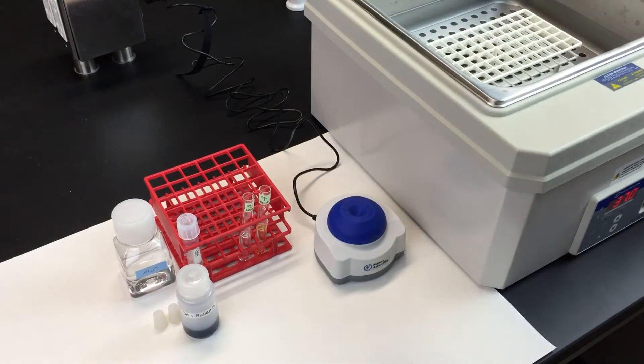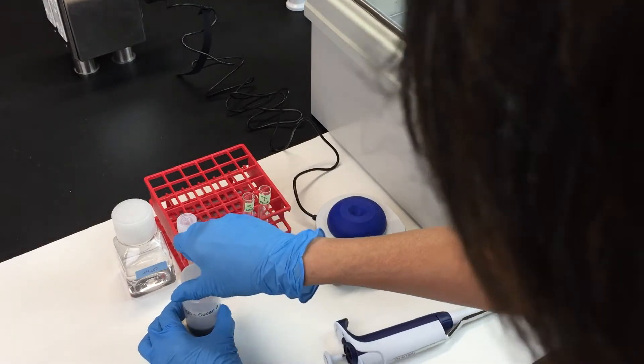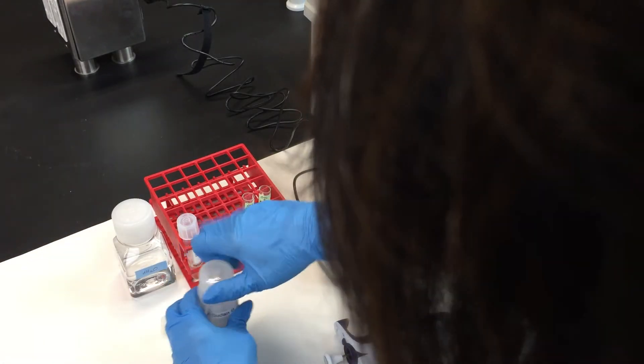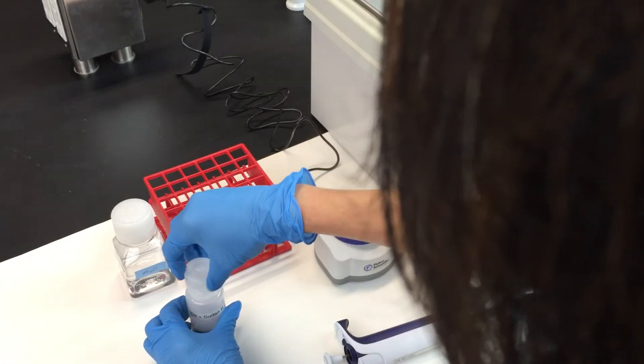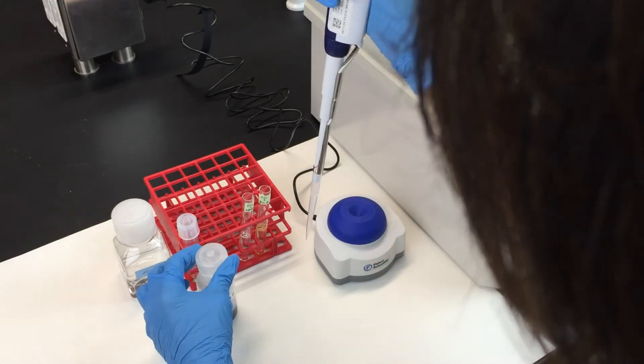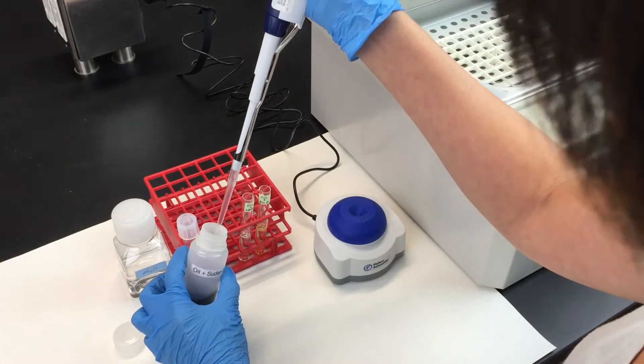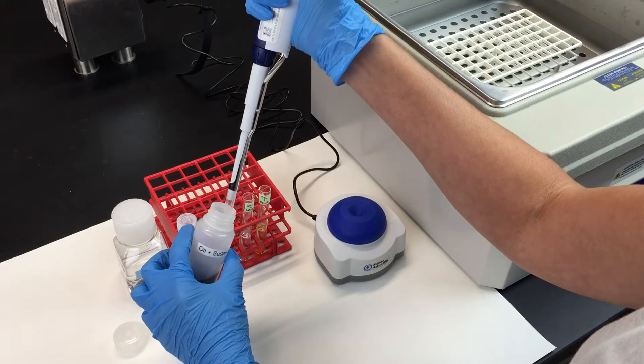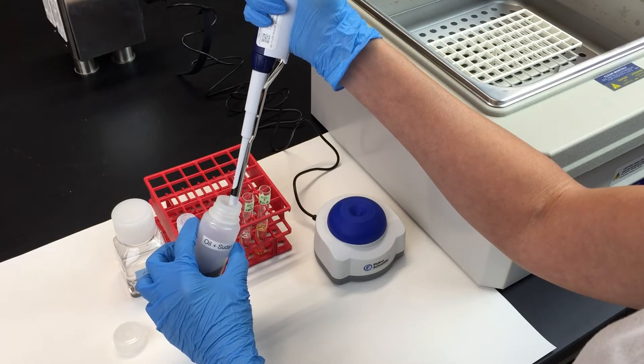Now add one milliliter of Sudan B dyed oil to each test tube. Sudan B is a dye that's used to help make the oil droplets easier to see. When pipetting the oil make sure you go slowly because the oil is very viscous.